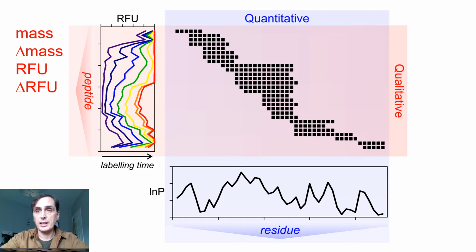And when we operate on a high resolution level, we can extract a kinetic model with a lot more informative metrics.